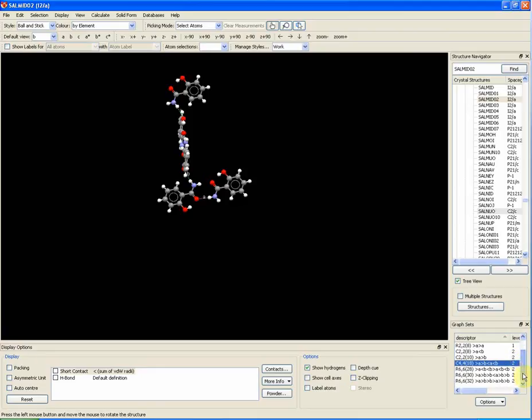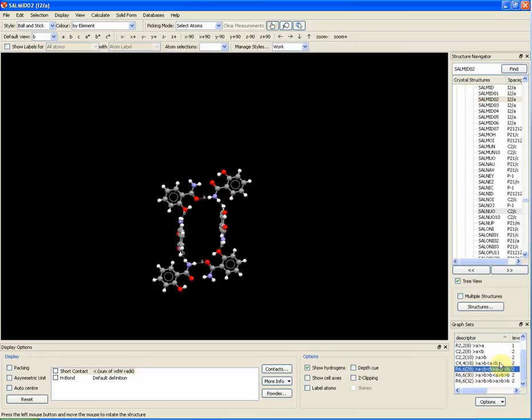We can also see an interesting 6-atom ring, represented by R6 in the graph set box.